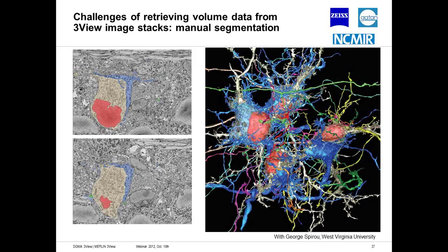I just saw an animation of the latest series of whole cell reconstructions yesterday, and I asked George if I could show them here. They're just absolutely spectacular. But he wants to debut them next week at the neuroscience meeting, so if you want to see them, you're going to have to hunt down either George or Mark directly. Now, this manual segmentation process can be very tedious and labor-intensive, but fortunately there is a serious effort to develop auto-segmentation algorithms to streamline the process.